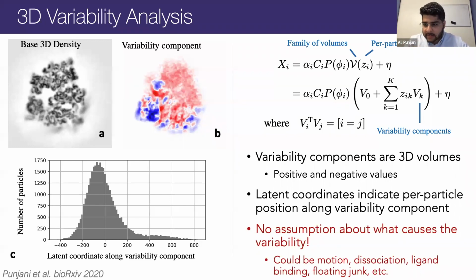So for example, if the ice is much thicker on one day or another, or your defocus settings are very far off one day or another, or the magnification is a little bit different, those changes will end up getting picked up instead of what you're really interested in.